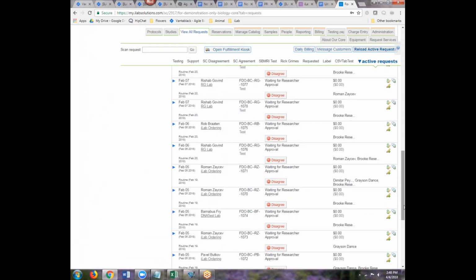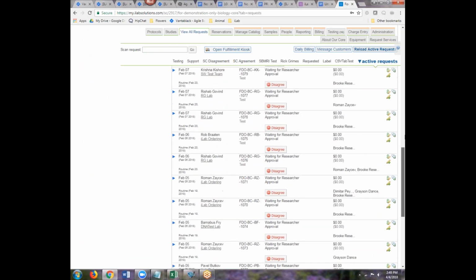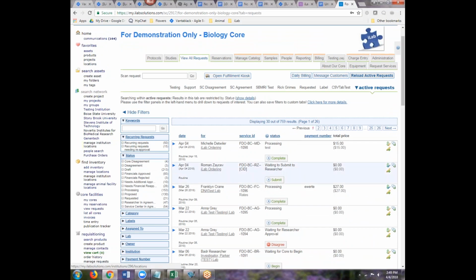Are they able to copy and paste into that grid, like from an Excel? Yep, sure. They can copy and paste, or they can upload the spreadsheet right to the grid, or they can enter it by hand. There are a few different ways they could do it. Okay.